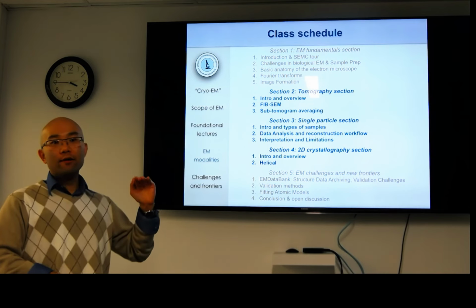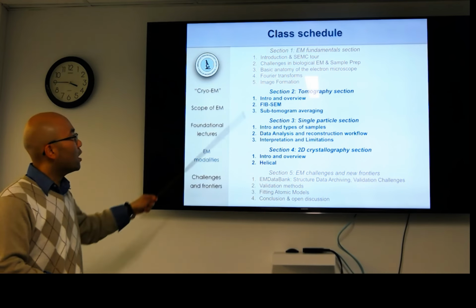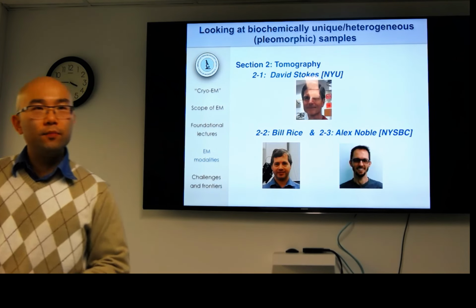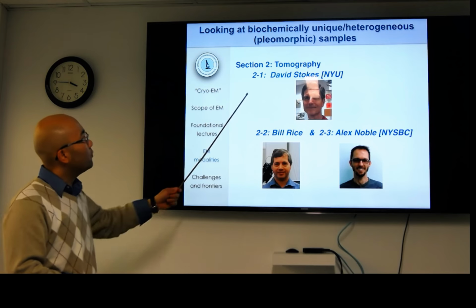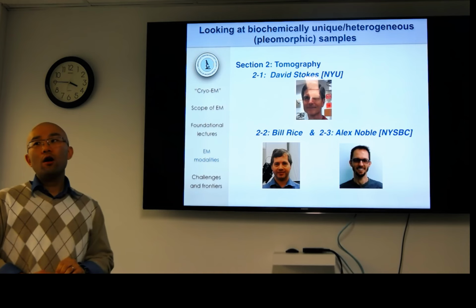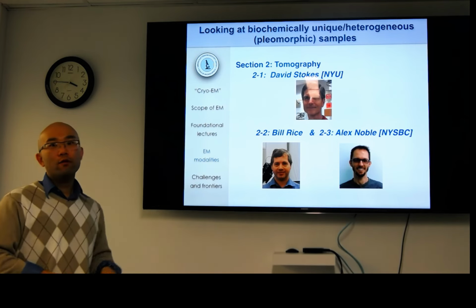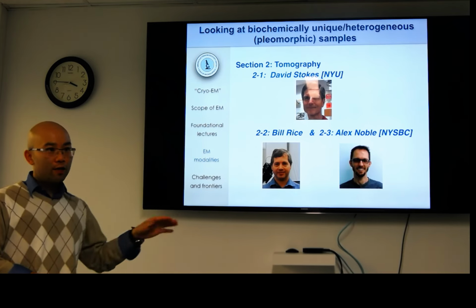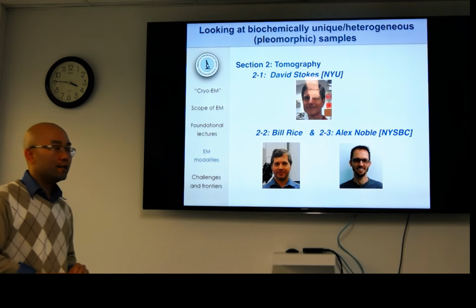After we get the background out of the way, we'll really dive into the three modalities of EM: tomography, single particle, and 2D crystallography. And what people find interesting in each of these topics has evolved over the years. First up, we'll have David Stokes from NYU teach us about tomography. As with all EM specialists, they do multiple techniques. So David has done tomography quite a bit, helical reconstructions. He's also done single particle. So if you talk to any one of these EM people, you'll notice that we've used a wide range of techniques, even within EM.